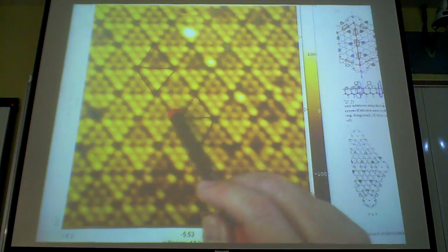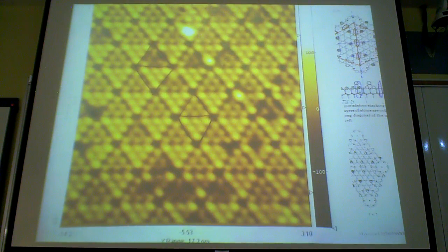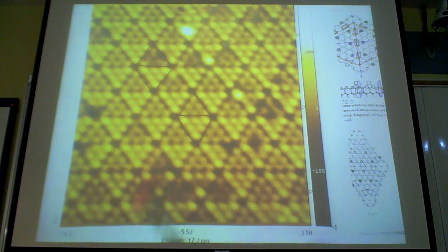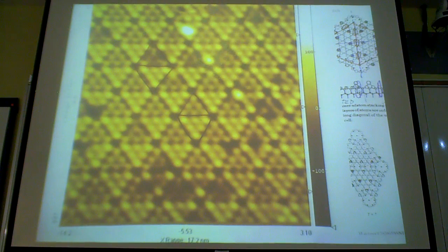Here I have a nice, beautiful 7x7 grid, and if I put a very tiny amount, a few molecules at a time onto this, and find those few molecules, I know exactly where they go, and that's great because I can do surface-specific chemistry on those. But if I want to go to the real world, you can't, because you cannot really study high exposure on an STM surface. If you have high exposure, you lose the surface registry, right? You have no idea where you are, because dirt looks just the same as your target molecule, and then it becomes a big mess. That kind of image is totally useless, because you have no registry to the surface grid.